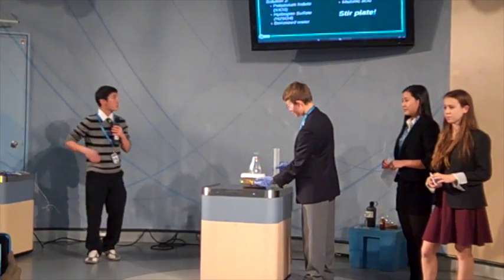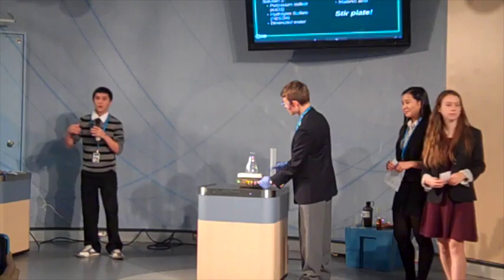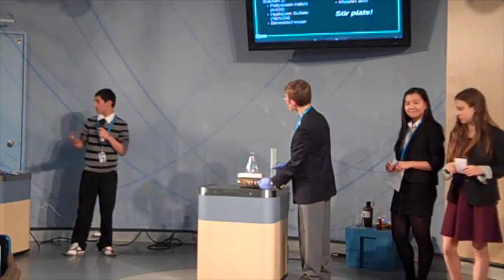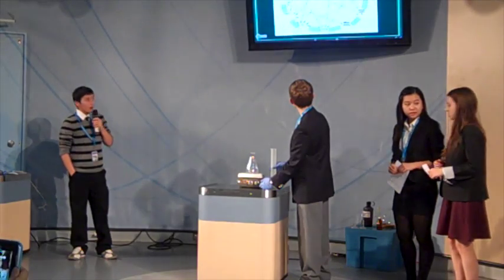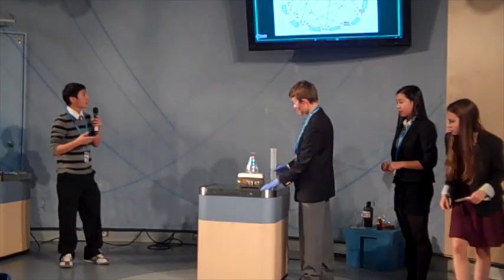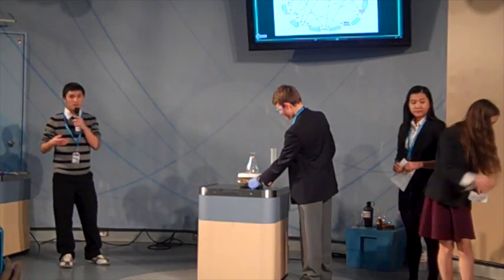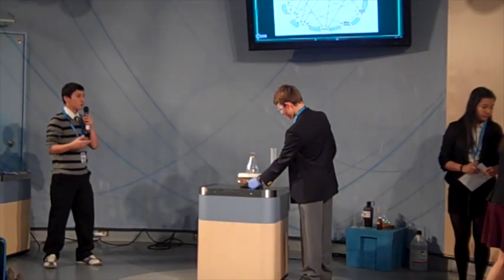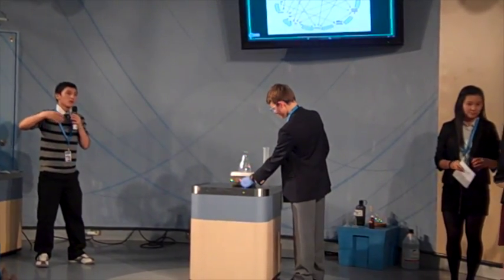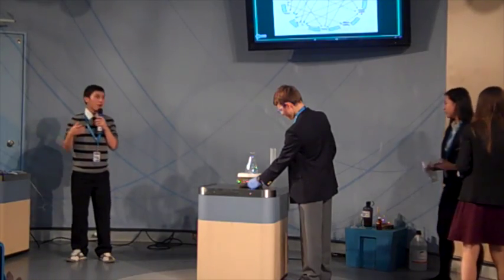So we're going to be showing you a few ways of how we can explain it with varying amounts of information. Alright, so this is just a graph showing all the different interdependent reactions involved, and as you can see there's a lot of things that all rely on each other, so it's really difficult to pinpoint what's dependent on another just because of how much stuff is going on at the same time.